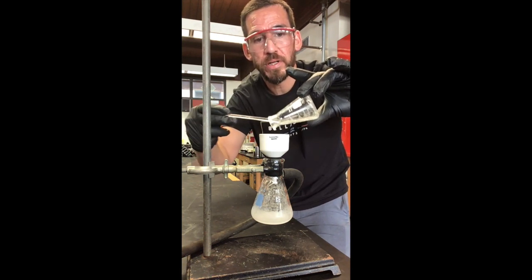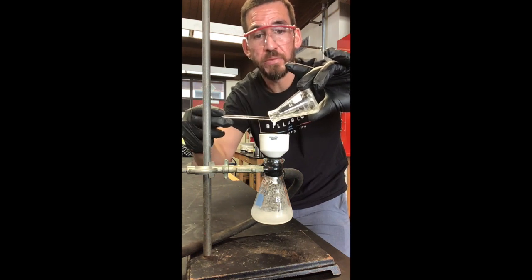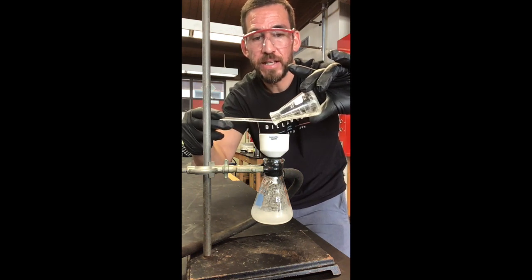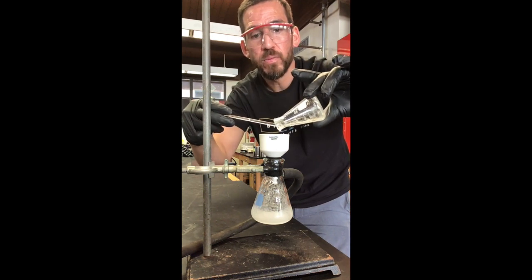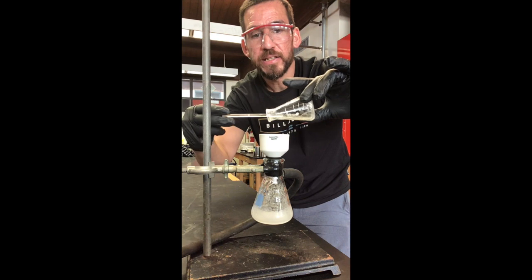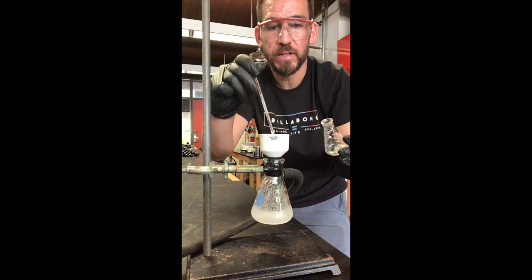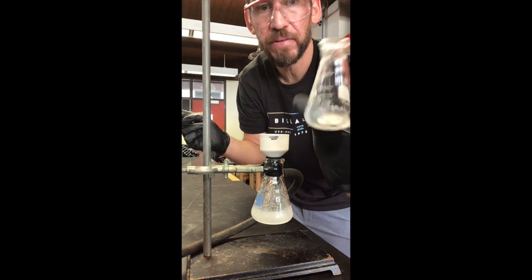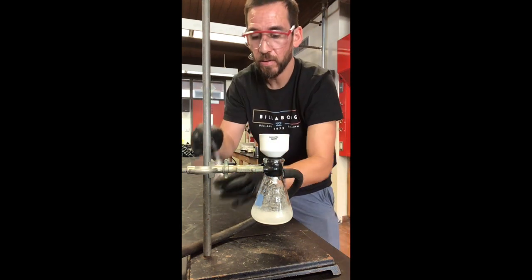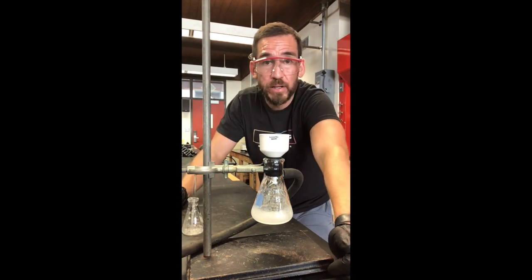And so what we want to do is actually rinse it with cold ethanol because, as we know, caffeine is less soluble in cooler ethanol. And so this will prevent any significant loss by dissolving it, but we can still get more of the material out. And check it out. There's a good amount of caffeine stuck in here. And so it might be a good idea to rinse that in another scenario.